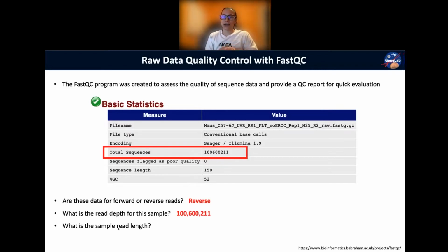And then Joel, you kind of jumped the gun on this one. Amanda, why R2 and not just R? For the labeling here?